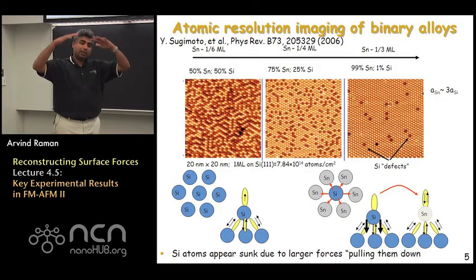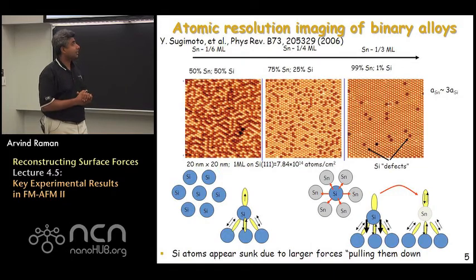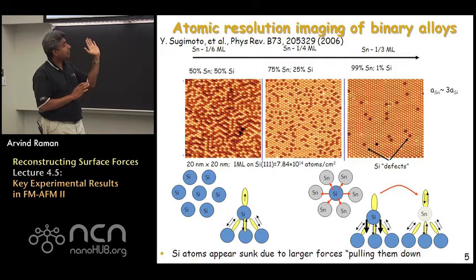The surface is heated up, brought down to room temperature, and the tin atoms basically completely reintegrate themselves and become whole with the surface that one is trying to image. The bright spots actually are the tin atoms. They stand up a little more. And you can see as you move to the right, you get increasing coverage and you start getting more and more tin atoms.